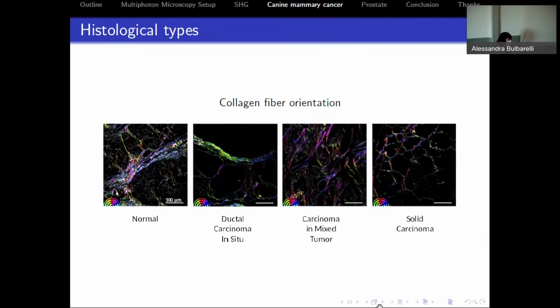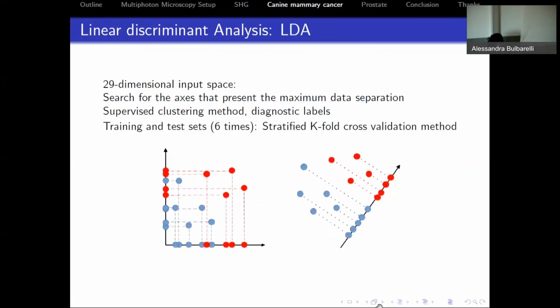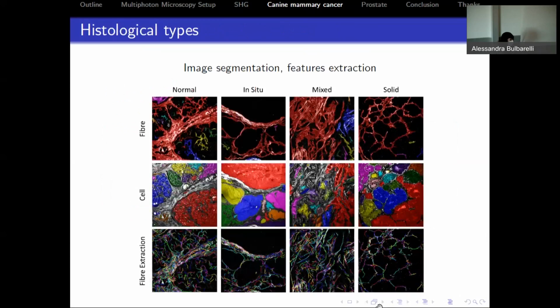So those were the ideas of features that we can extract from these images. Oh, sorry, I want to go back a little bit because I forgot to say one thing. In the cellular regions from these extracted networks, we can now evaluate the size of these areas, and how the density of cells is as compared to the whole area.